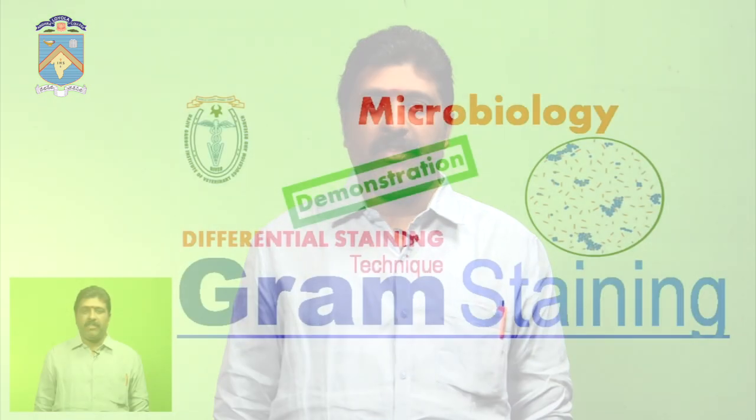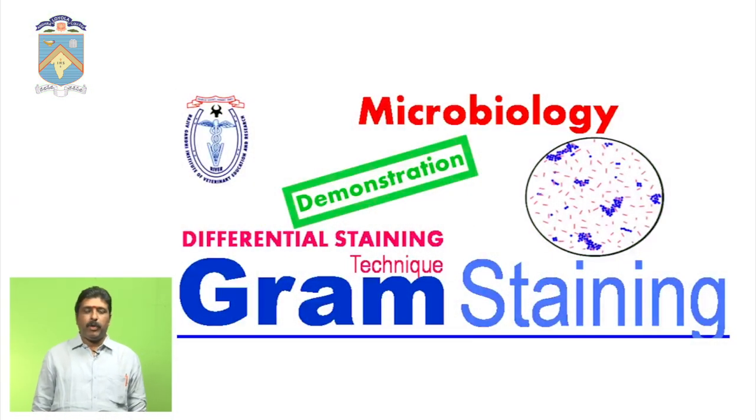Today I am going to discuss the most important topic in microbiology, that is staining technique. Microbiology is the basic branch of science which deals with microorganisms. We can't visualize these microorganisms with our naked eye. Only with the help of a microscope can we visualize them.